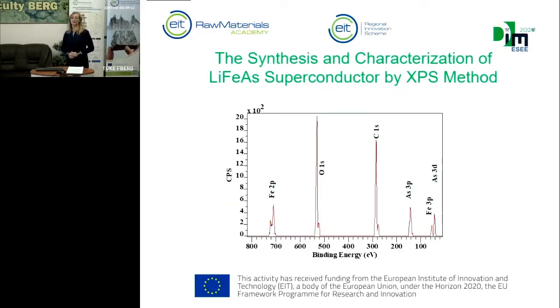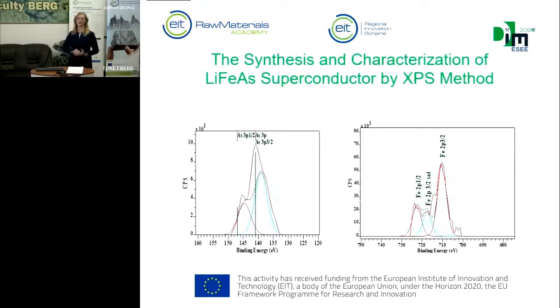By this device we confirmed the presence of iron and arsenic at the surface, and we confirmed the oxidation state of these elements, because the oxidation states of these elements are very important in the structure and in the behavior of this sample.